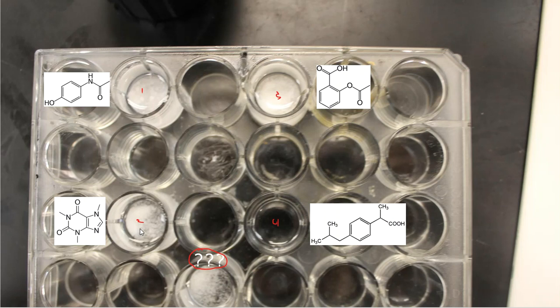If you tell me that your unknown is ibuprofen, which is in spot number four, I need to slap you. All right. And the reason is because I want you to look at this. It can't be number four. Number four fully dissolved without a problem. Ibuprofen, when I hit it with the ethyl acetate, completely dissolved to a point that it looks like that well is empty. And my unknown did not do that, did it?